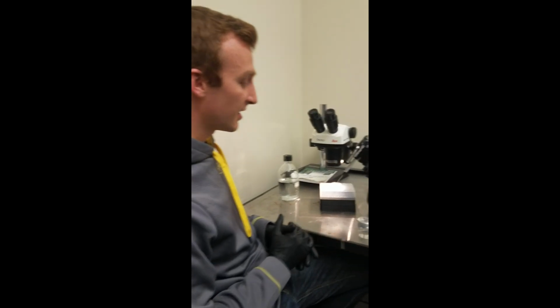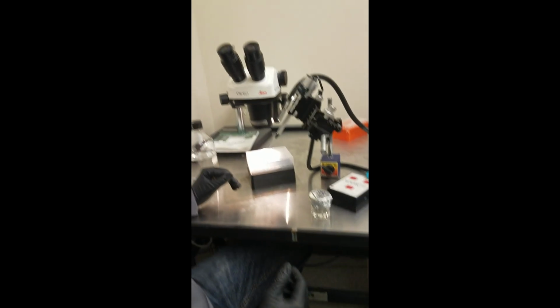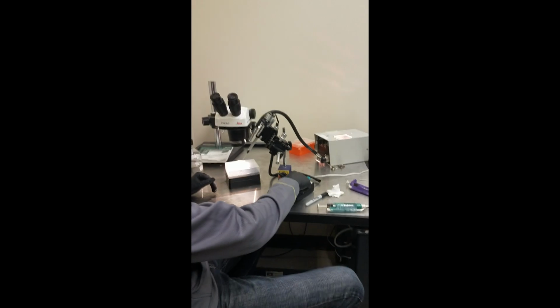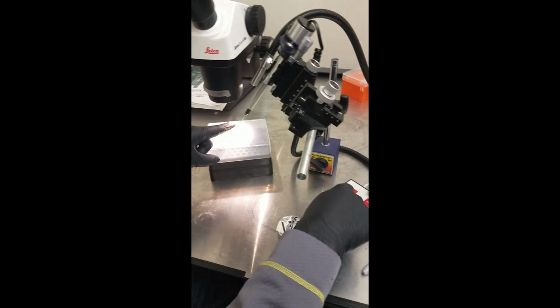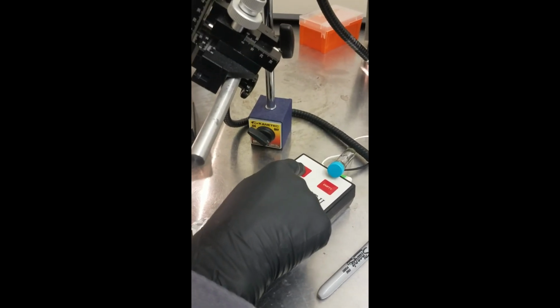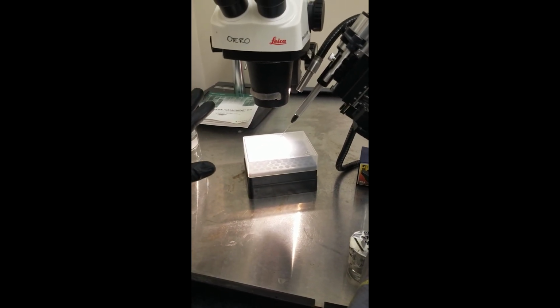And now the last thing that you have to do is clean up. After all of the oocytes have been injected and you take them back and put them on that oscillating dish, the next thing you have to do is take care of all of this. First, you push fill, which will pull the plunger all the way back up. So you have to just push and hold fill until the plunger is completely retracted into the machine. Then you can pull off the glass needle and just throw it away in a sharps container.